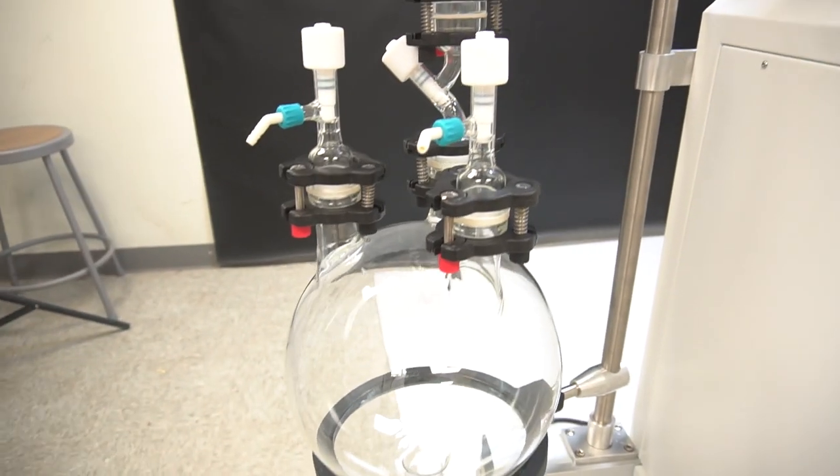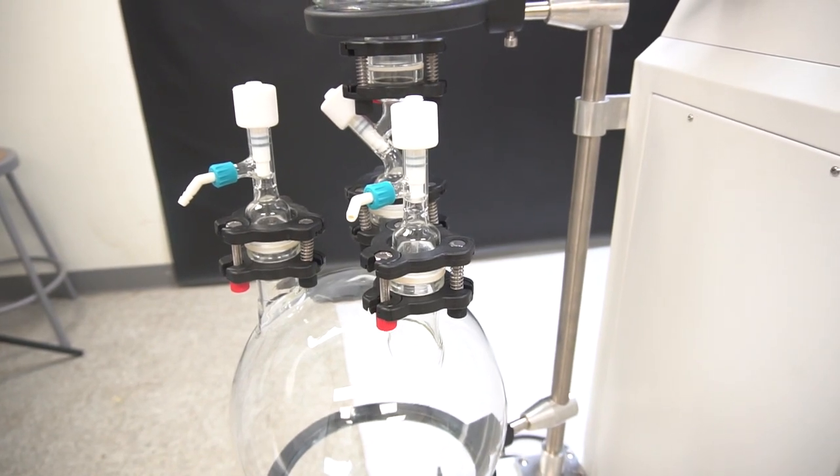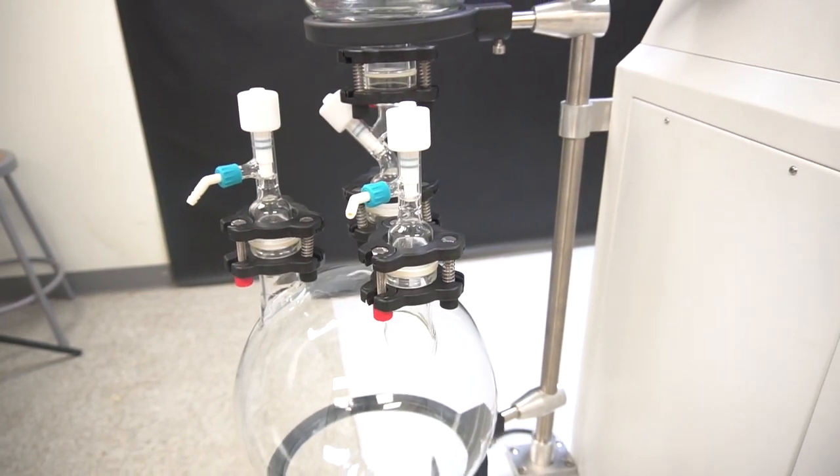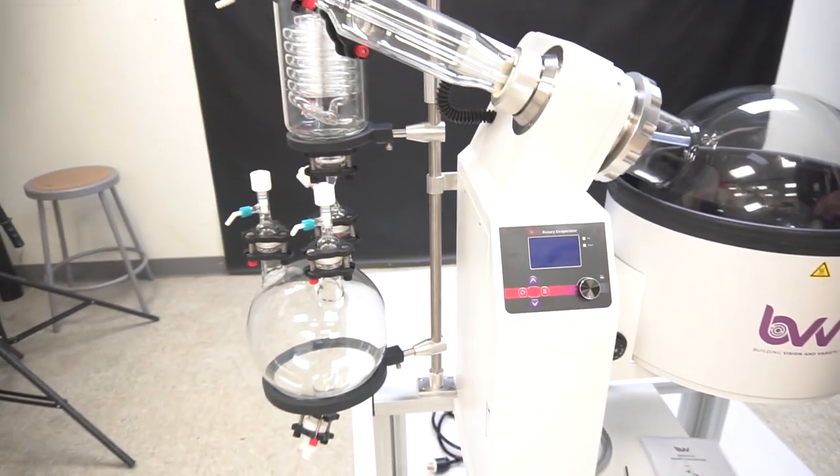These can be used to pull vacuum in different sections of the system. For example, after you remove all the solvent from your receiving flask, you're going to have to pull back in it again before opening it. So those are some of our features.